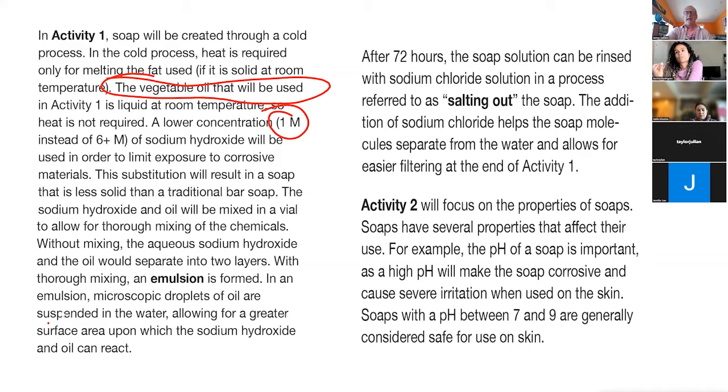And what we'll do is we'll add some sodium chloride solution to help rinse all of the sodium hydroxide away, because you don't want to have concentrated sodium hydroxide in your soap. You could imagine washing your face with concentrated sodium hydroxide. Not fun. So you'll be doing that on Friday or Saturday, whenever you get to it. So that's what we'll start today.